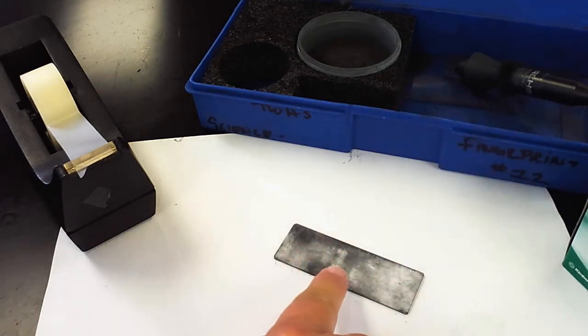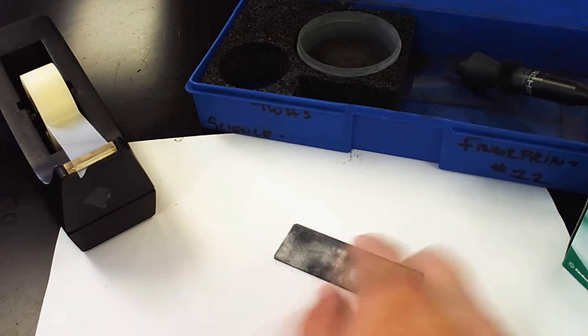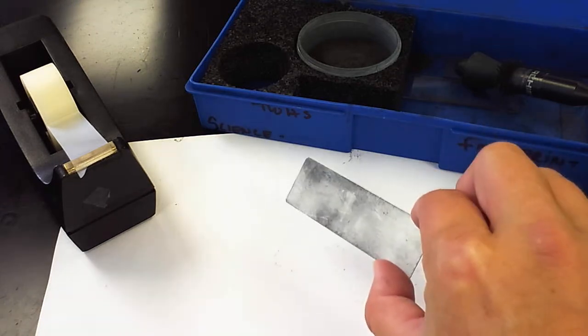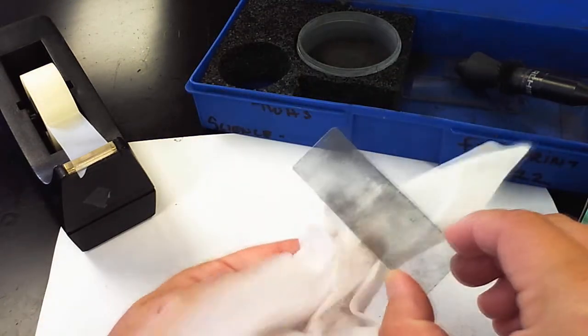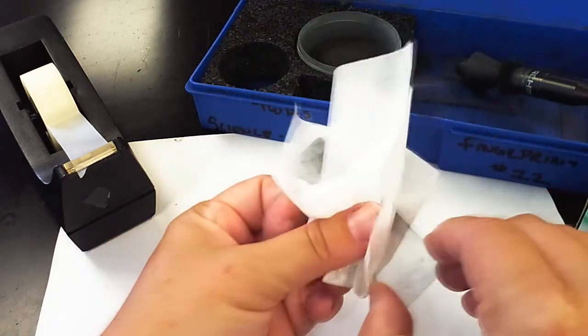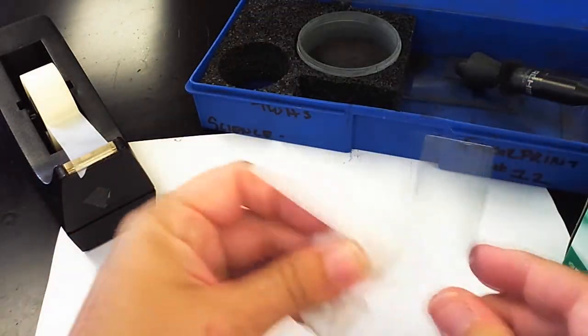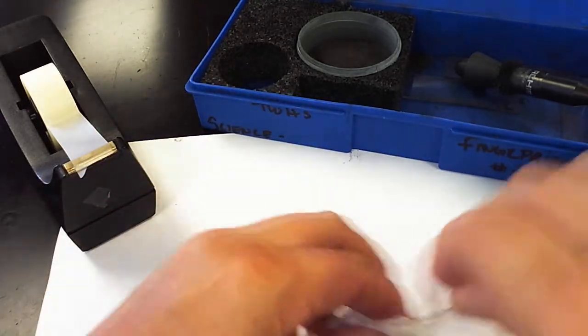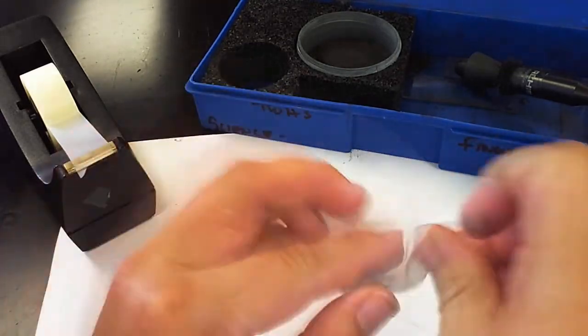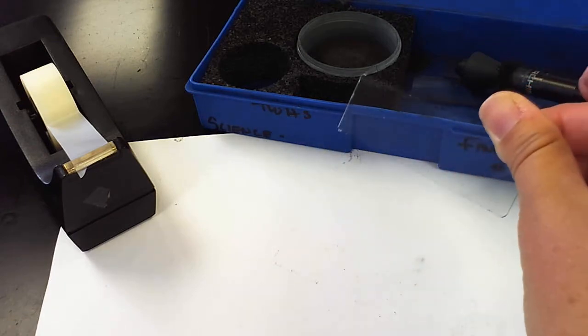So we're going to be leaving our fingerprints on these microscope slides. You can tell this slide is pretty dirty. So the first thing you want to do is clean it off. Go ahead and use one of those chem wipes to really wipe that down so that you have a nice clean slide to work with.